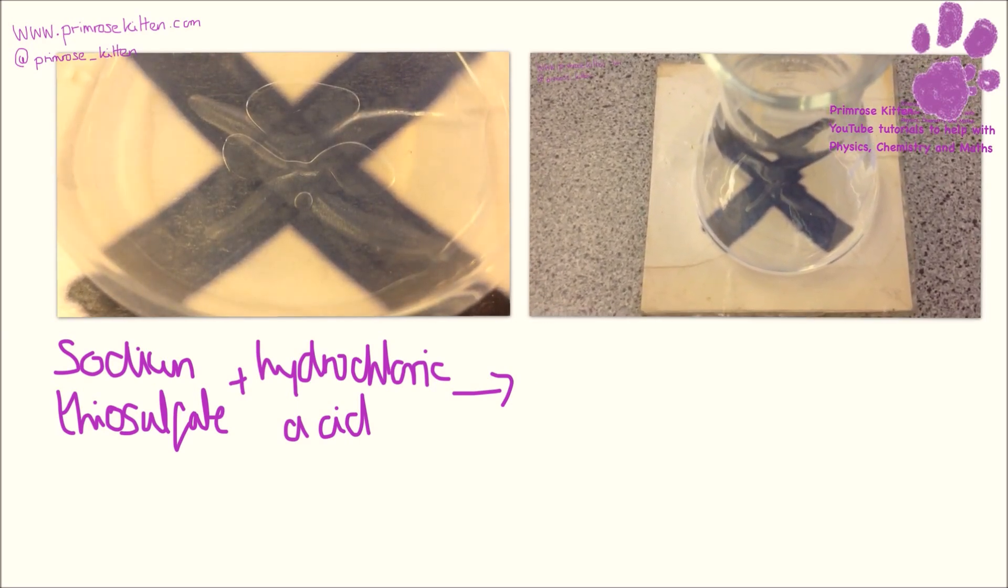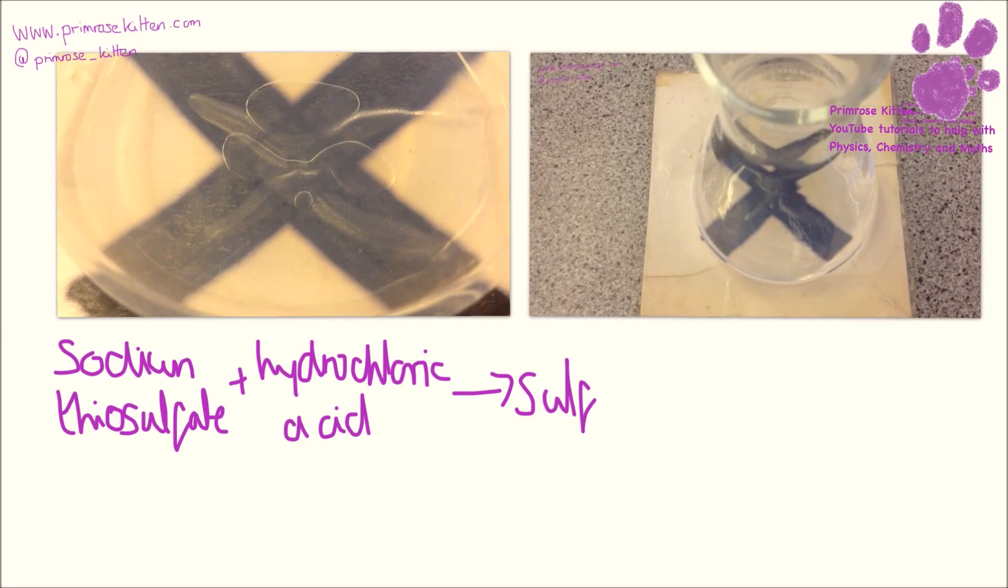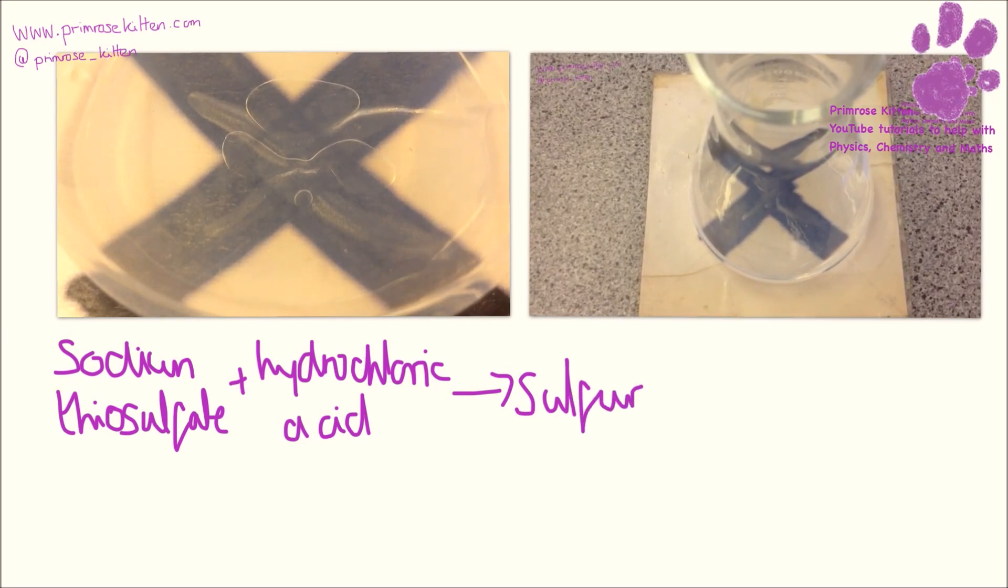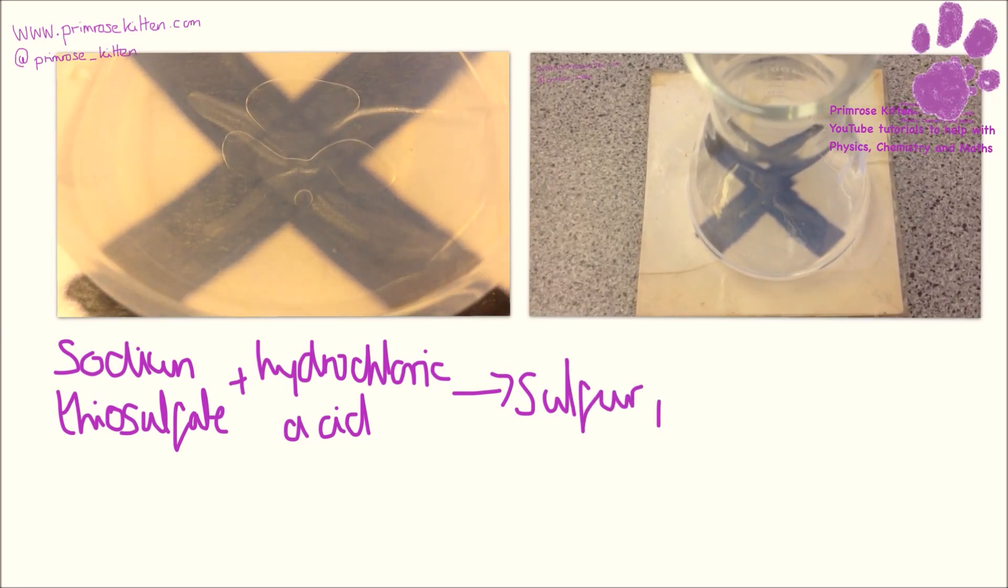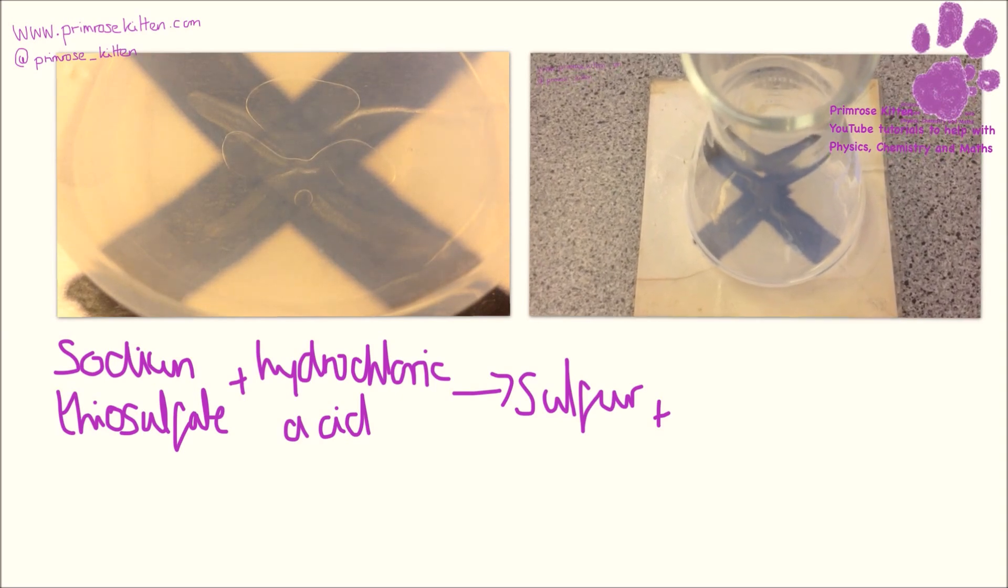Now the reason it goes cloudy is because of the sulfur being produced. And after a while, what you will start to see is that you won't be able to see the cross on the bottom.